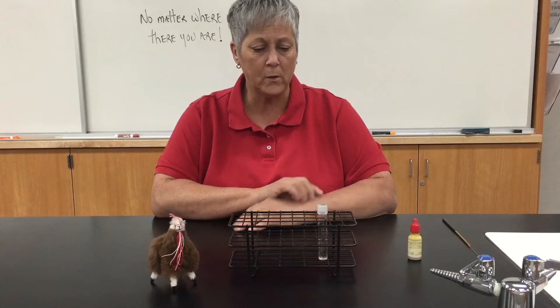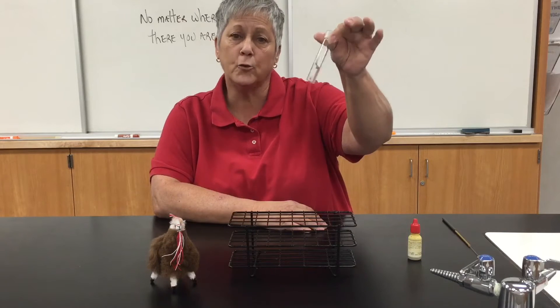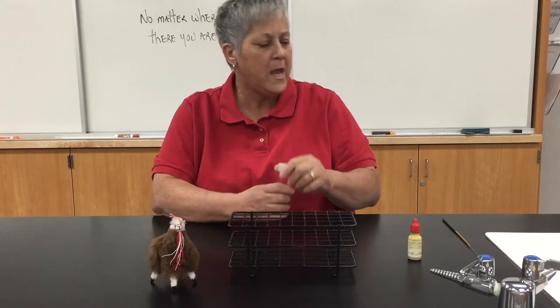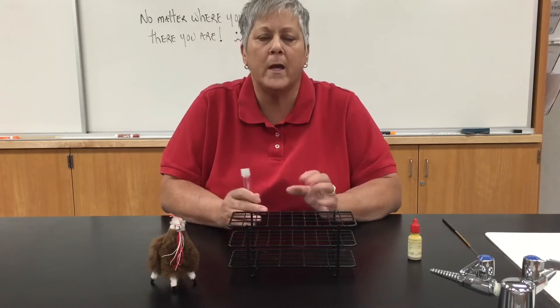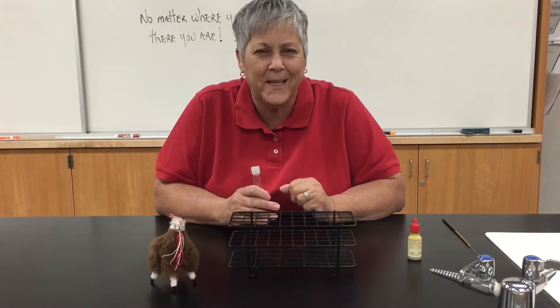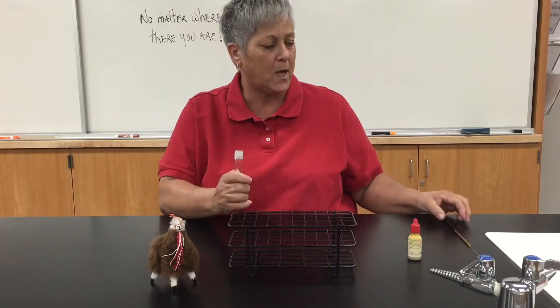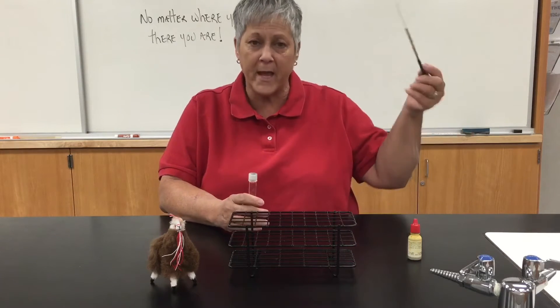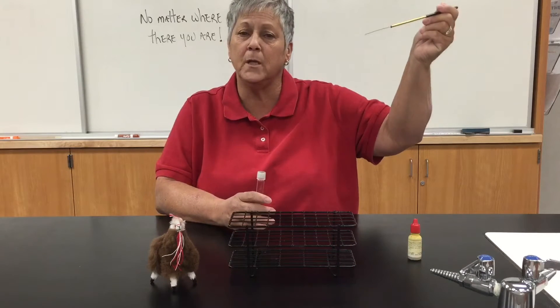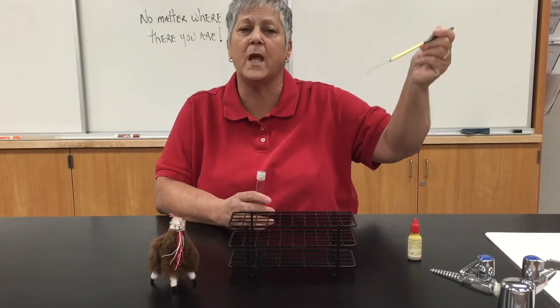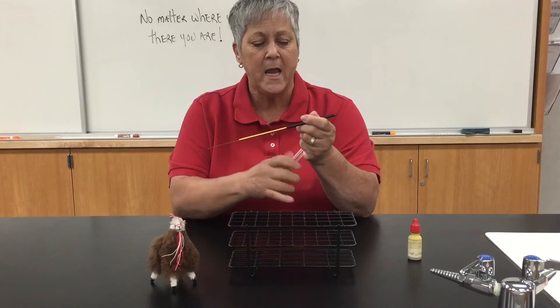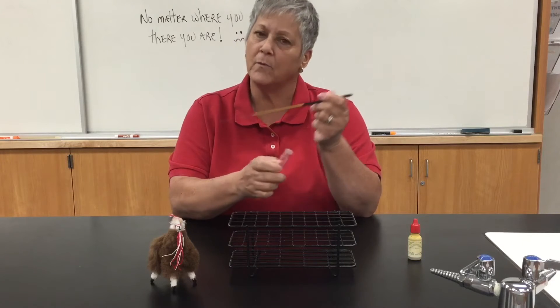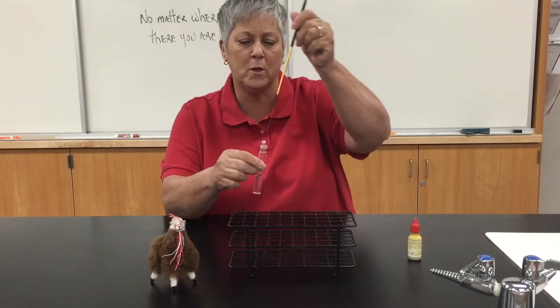Here's how you run the test. This is tryptone broth right here, very rich in tryptophan. I am not using any live microorganism for this part of the demonstration. I would aseptically retrieve a little sample from my original slant and I would flame the lip of the tube, of course.